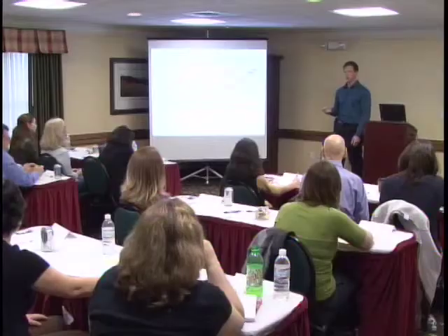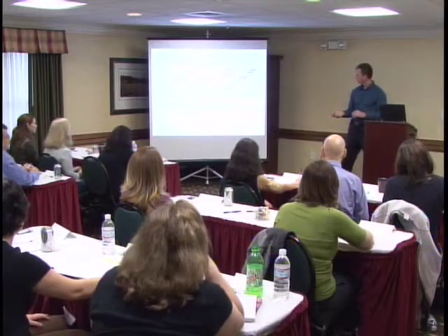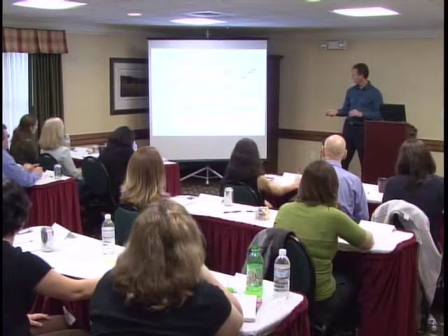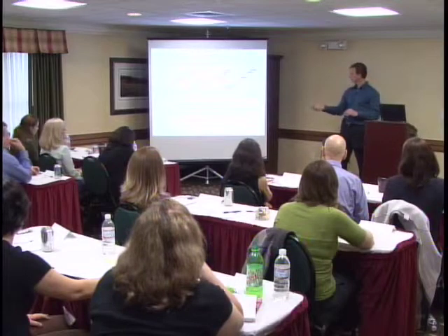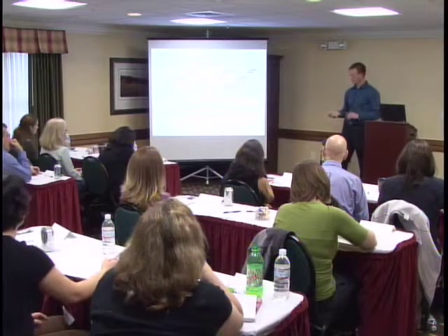8 is a good number for us because we use a 96-well plate format. 8 is a column, so you can get 12 columns on a plate. The product masses then are put together such that the products separate in mass space and don't overlap each other.